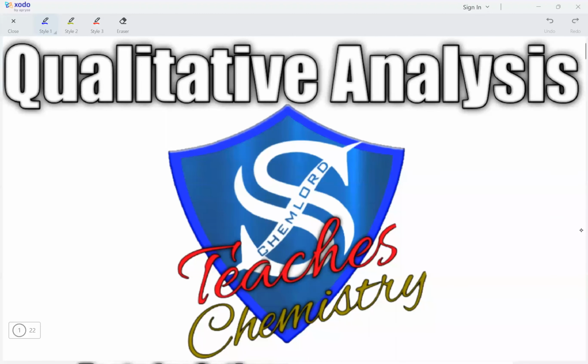Hi guys, in this video we will be dealing with the qualitative analysis test for anions. We've got a number of anions that we need to test for in the lab, and these anions have individual tests that we need to remember. So these anions include the carbonate ion, the chloride ion, the bromide ion, the iodide ion, the nitrate ion, the sulfate ion, and the sulfite ion. So let us begin with testing for anions.